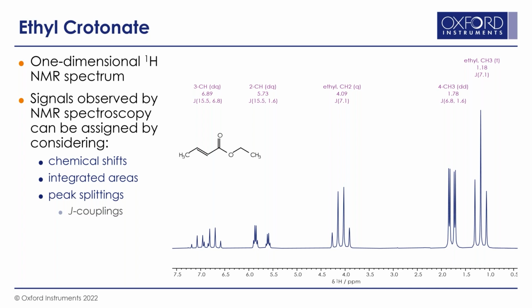The magnitude of the J couplings can be measured directly from the spectrum, and for proton-proton couplings can be up to 18 Hz. Since J couplings and peak widths are fixed in frequency, their widths on the chemical shift scale used in NMR spectroscopy are dependent on field strength. For example, the methylene signal at 4.1 ppm has a width of around 25 Hz.